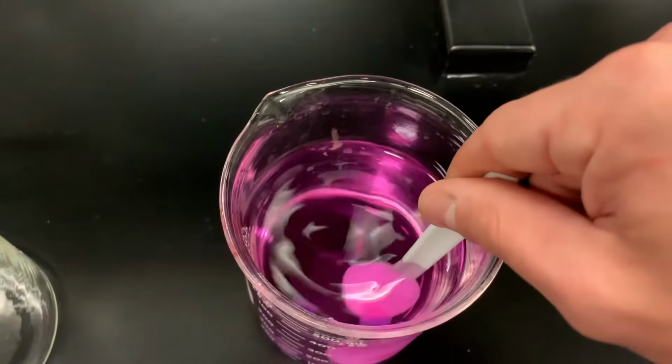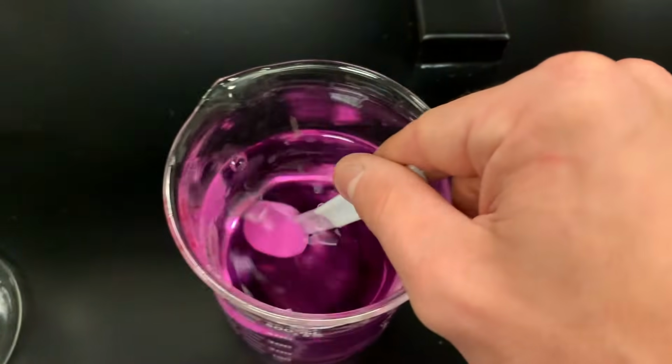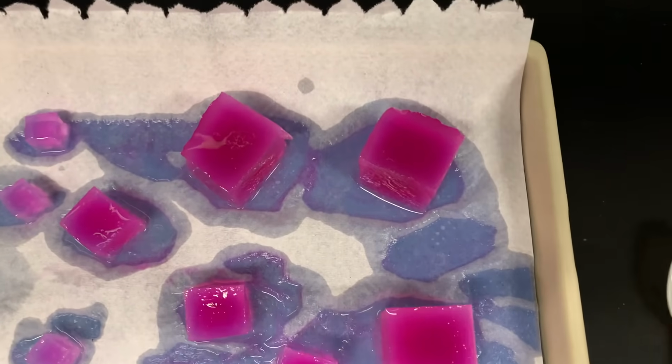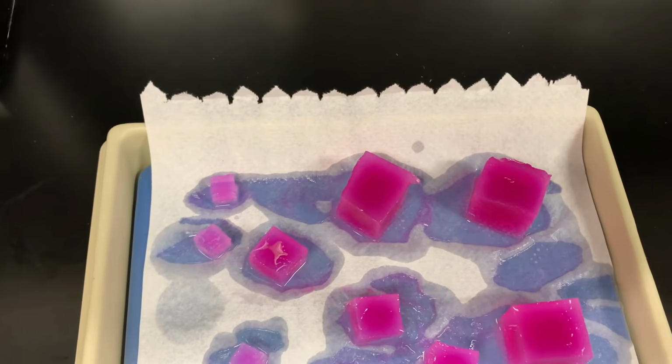All right, so you guys can see we retained our pink purplish color here. All right, and they are completely translucent. We could see through them. I don't want to touch them, but we could completely see through them.